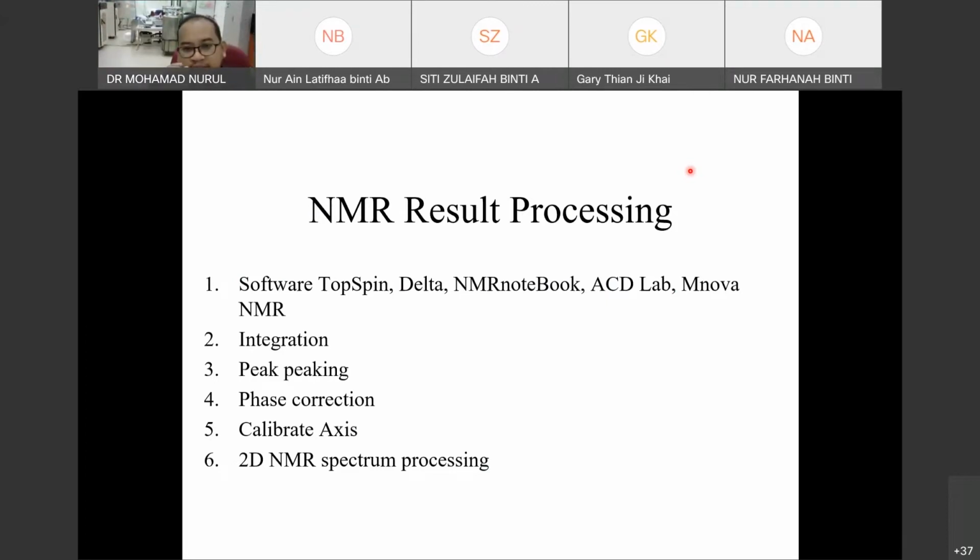If you prepare the samples too concentrated, there will be drawbacks. For the proton NMR, it will give not very nice spectra. We cannot see the splitting clearly, how the peaks are splitting. But for the carbon, it will take a shorter time. Please be aware of this. For example, if you need to proceed with proton and carbon, it's better to prepare concentrated samples. If you only want nice protons, less concentrated is also okay.